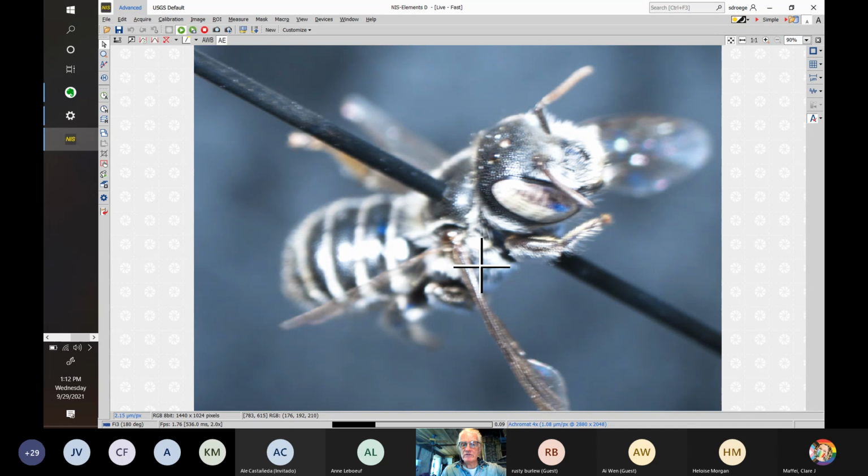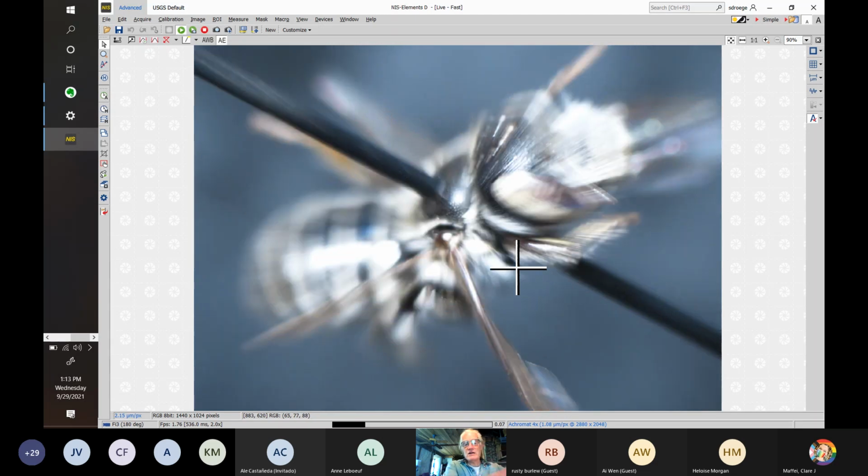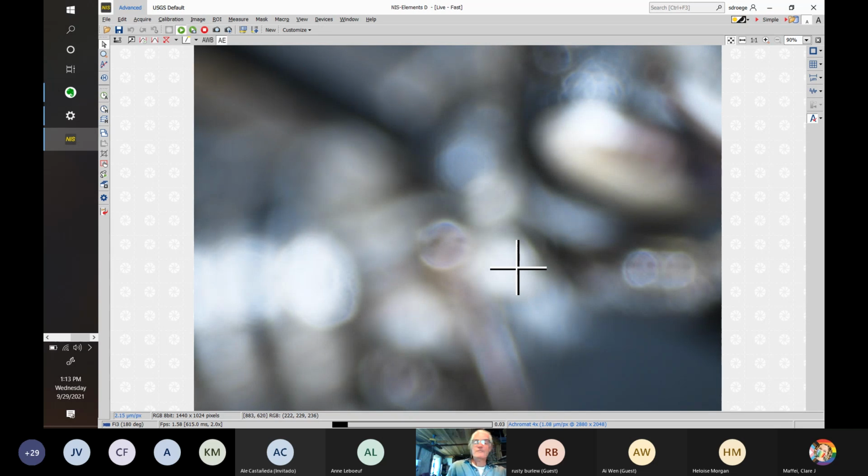Let's see if I can shift this a little bit, and get it a little bit more in focus. And then normally this side of the plate and this side, which is the front side, would simply curve over without any sharp demarcation between the 2 faces. They would just merge into one another. But here, and we'll zoom in a little bit, there's a very sharp line. This line here is abrupt, and there should be a carina in there. Let's zoom in and see if that is visible.